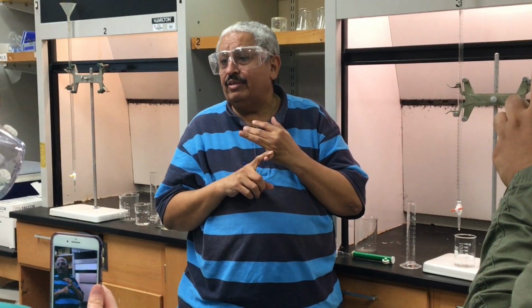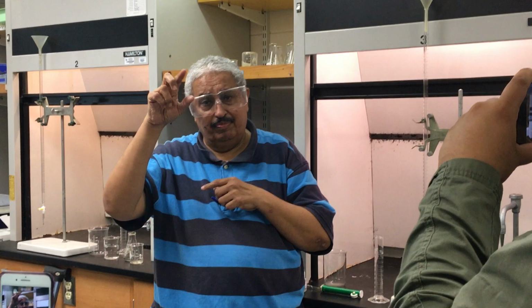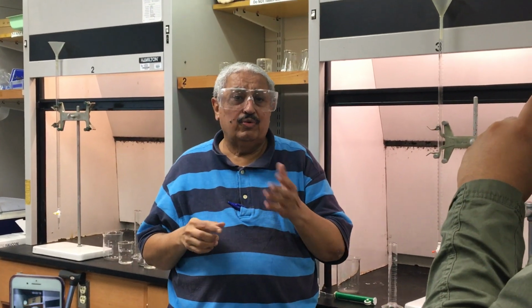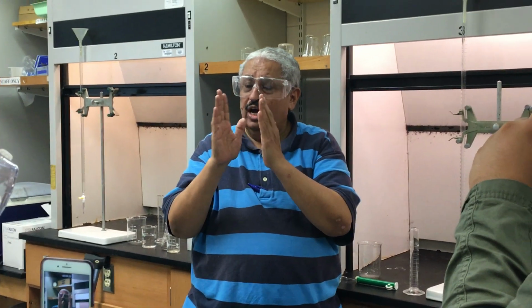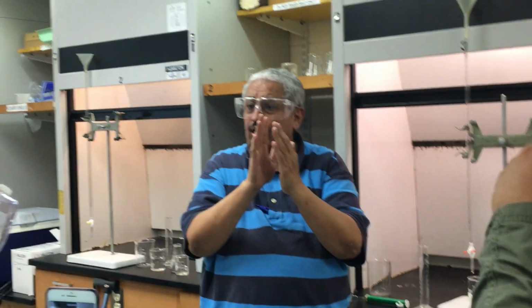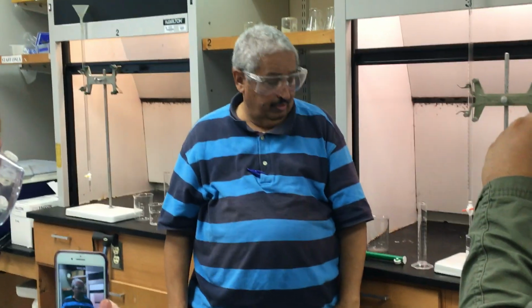The theoretical value is 5%, from the FDA. On the bottle it says 5%, correct? And today we'll find our percentage error. How close are we to the 5% theoretical value approved by the FDA?